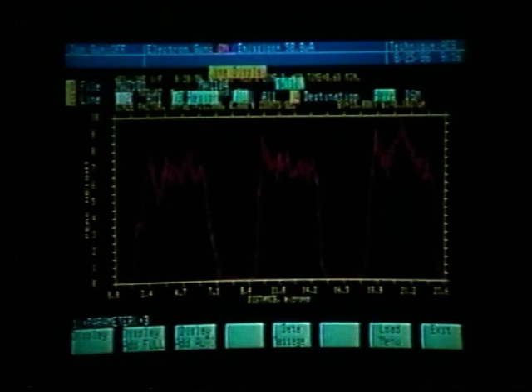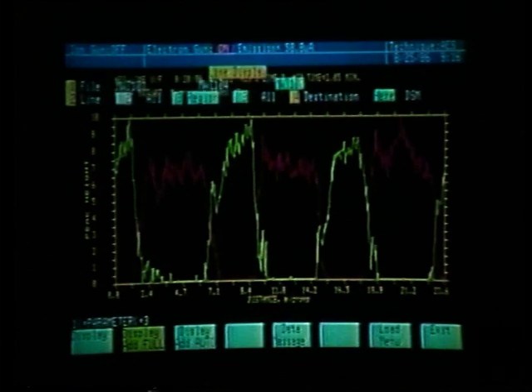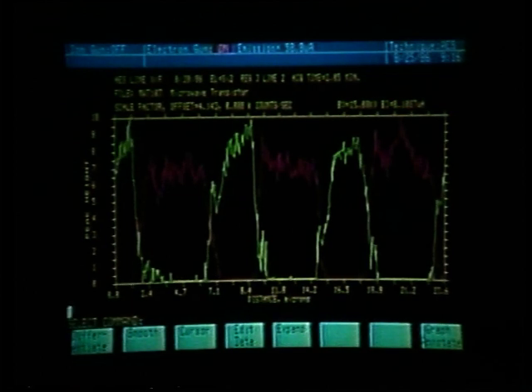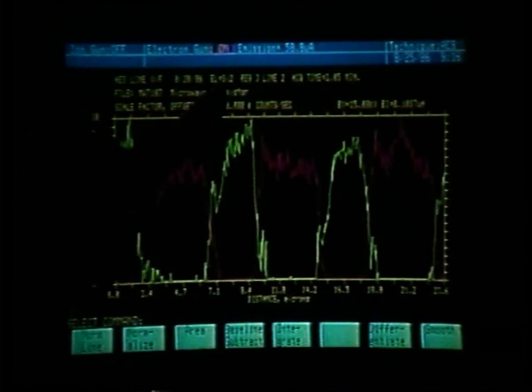And let's display add region number 3, soft key number 2. And let's then begin our data manipulation, pressing soft key number 5, entering the data massage, using the previous bank, which allows us to normalize the line. Once again, when we normalize the line, it will normalize the last line displayed, which is also displayed in our graphics label.